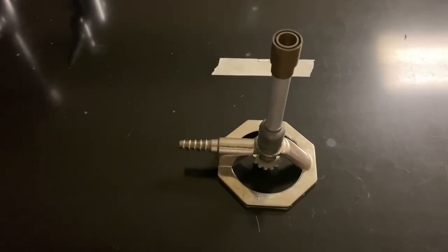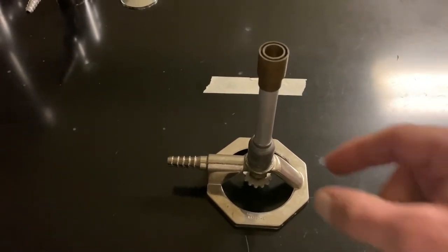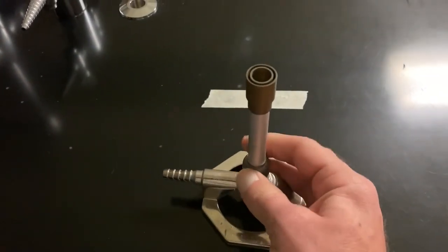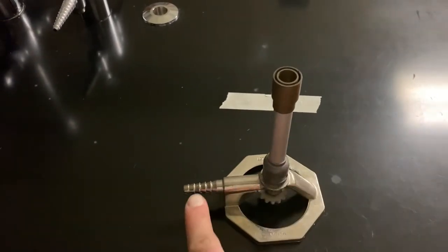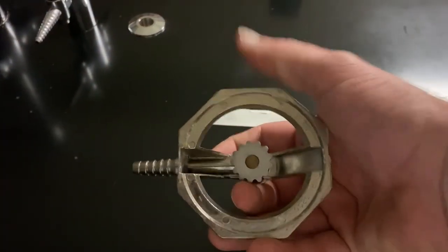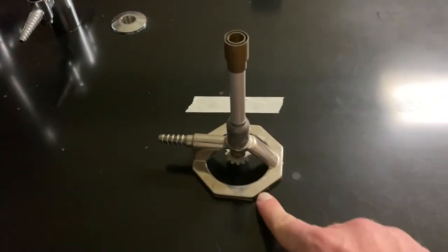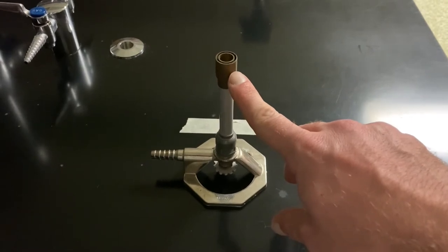If you look at the Bunsen burner, there are multiple components that you need to know. First is the chimney — it is threaded and it can open up so air can come in. There is a gas inlet, a gas valve at the bottom, the base, and the top is the spreader made of brass.